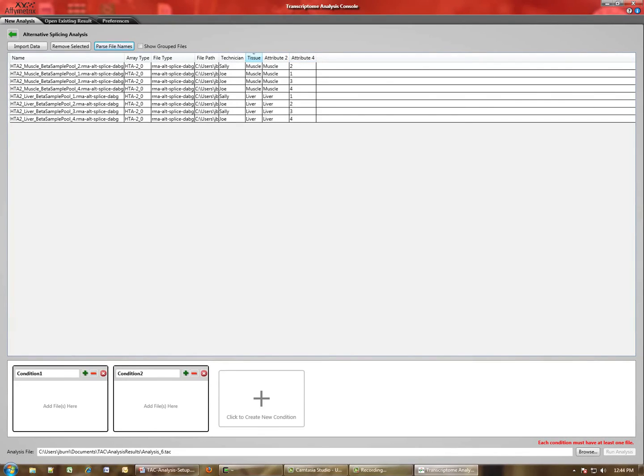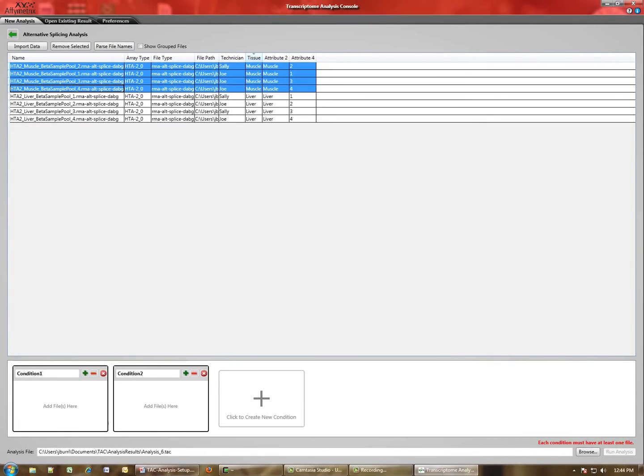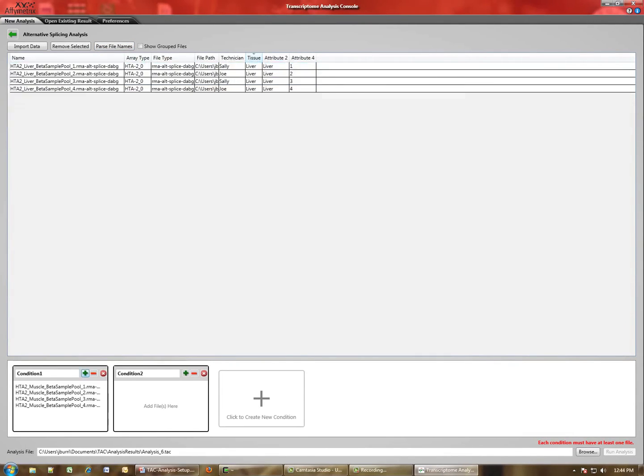We'll select the first four from Muscle. We'll go down here and click the plus to add them to it. We'll rename our condition.